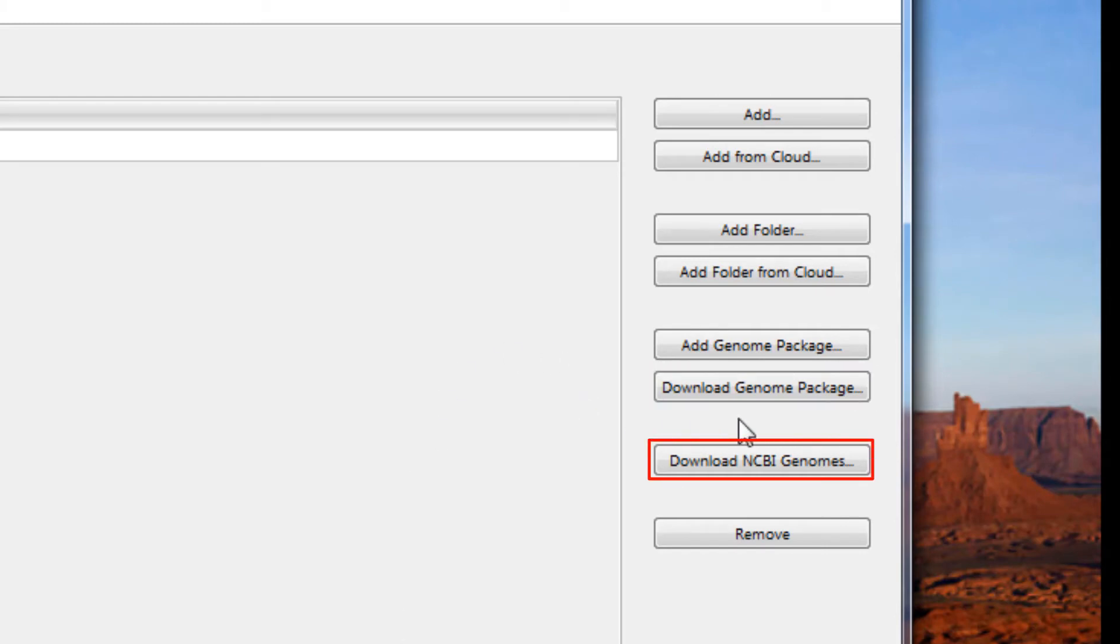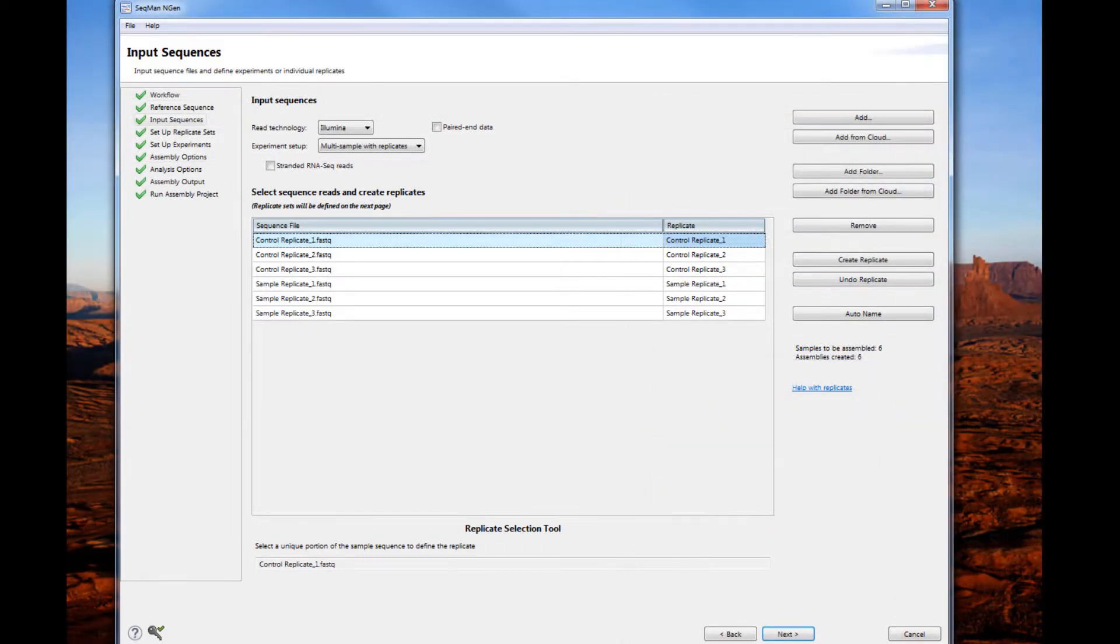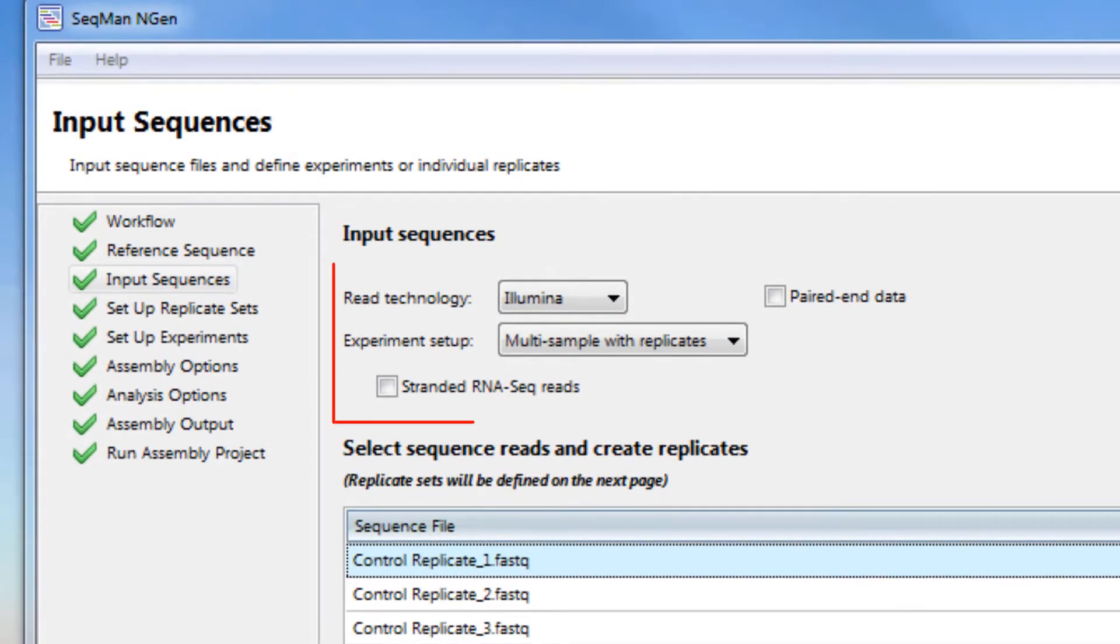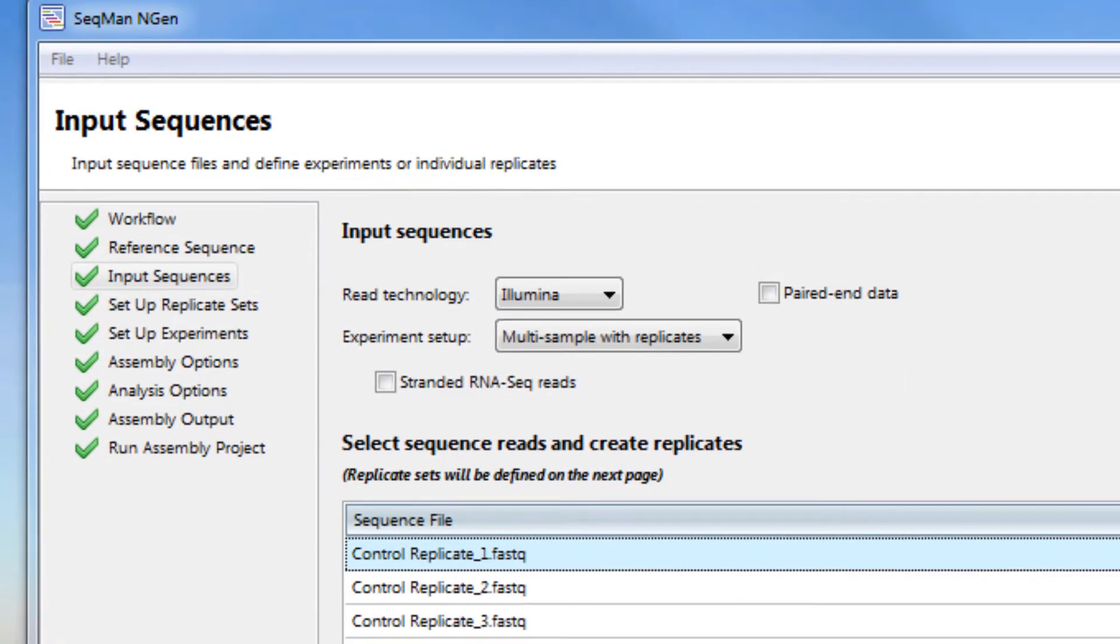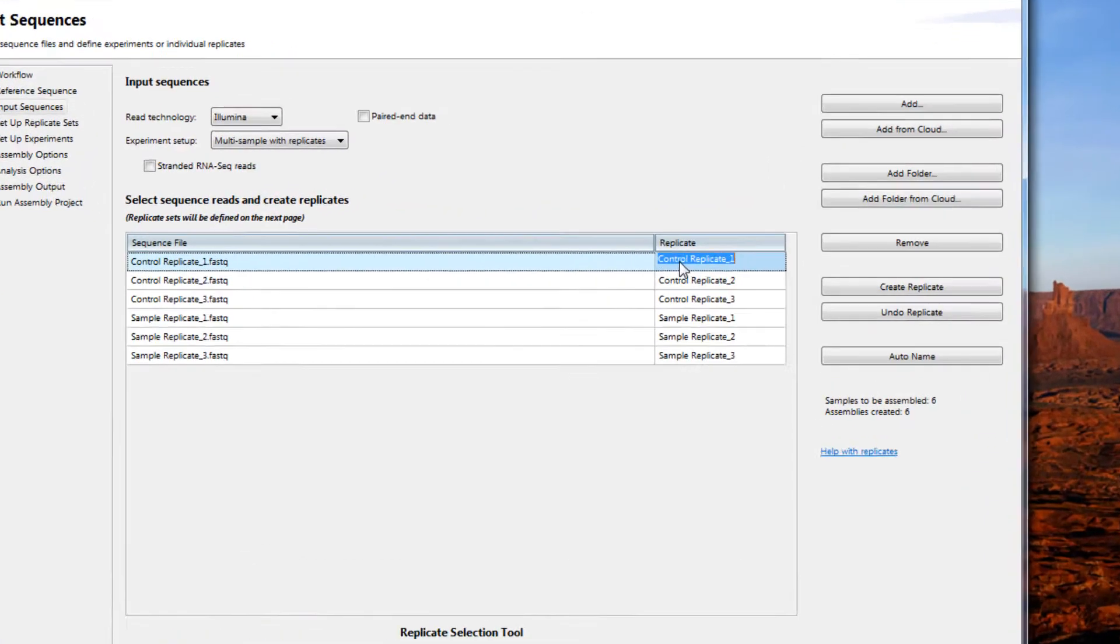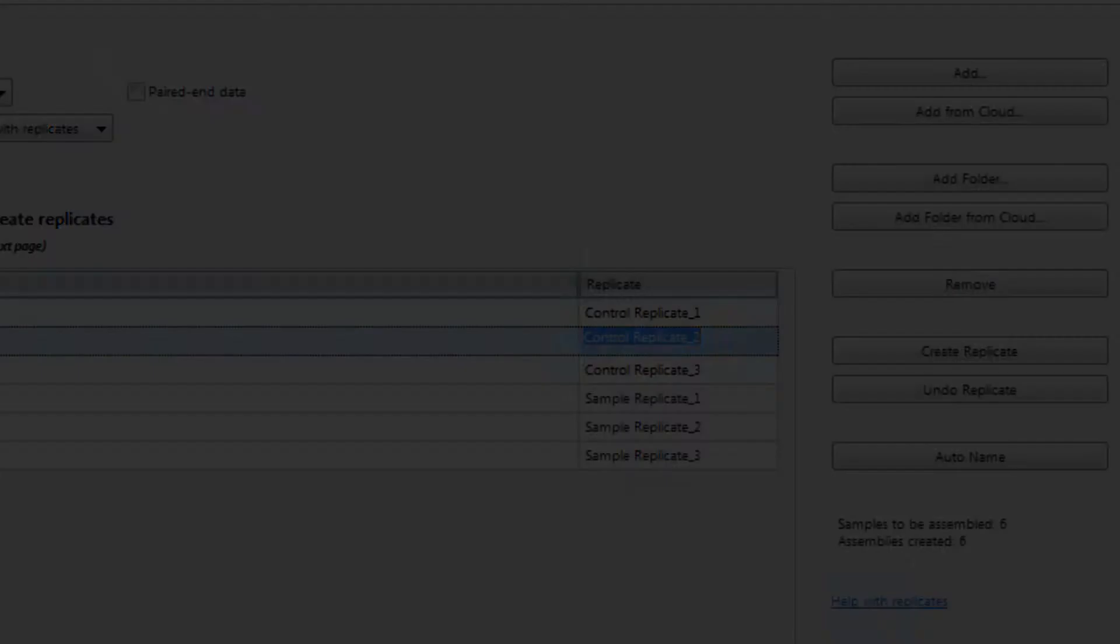In the Input Sequences page, you have the option to specify the sequence technology as well as the experiment setup. Once you have added your data, you can rename the sample by clicking on the sample name under the replicate column.